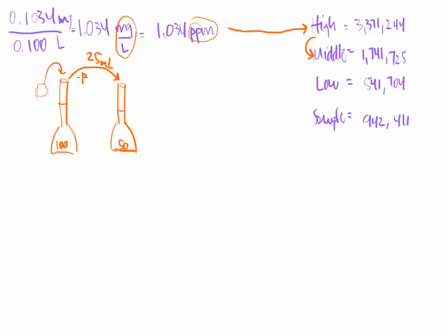And I did this through a pipette, right? That's very important. Whenever we're making solutions in a laboratory, we want to use a pipette in order to do those. So I took a 25 milliliter volumetric pipette. I pipetted out 25 mils and I put it into this flask and I diluted up to the line. Okay, well down here at the bottom, what is the concentration of this solution that I made that we have titled middle? How can I do that?